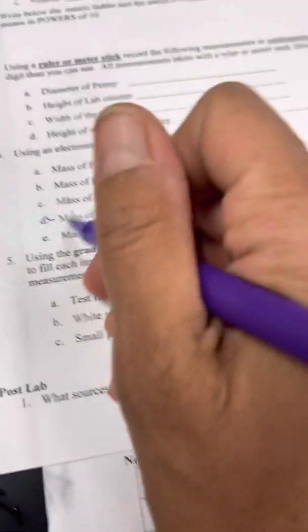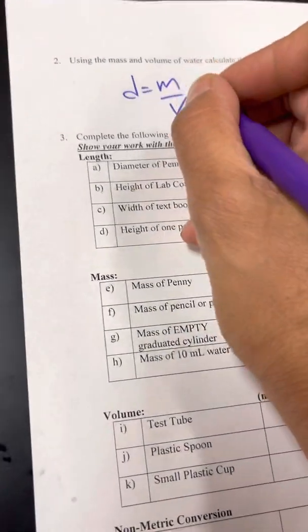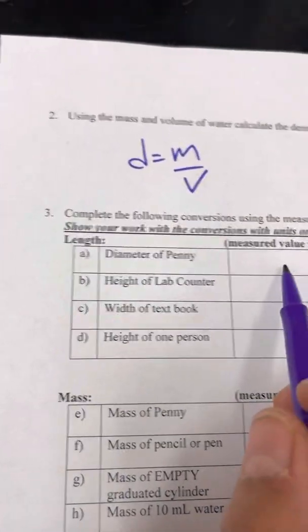The formula is density equals mass over volume. You're going to use from this section the mass you get here and this volume here to do that calculation. So you just plug in the mass and plug in the volume, and divide. And this one right here, you're going to convert these units.